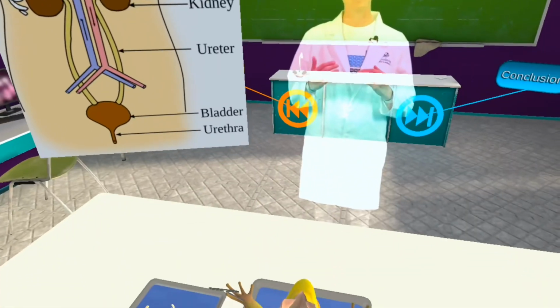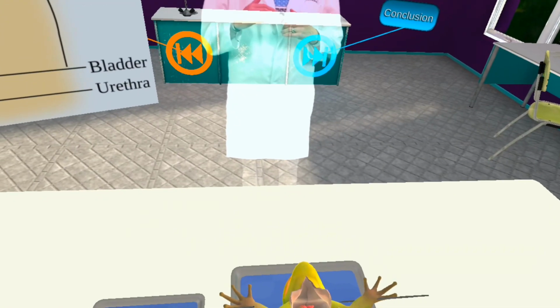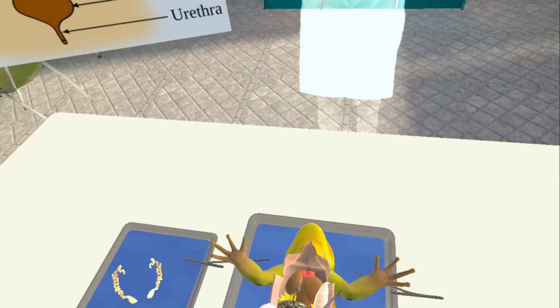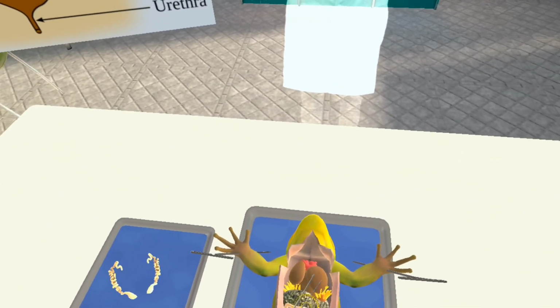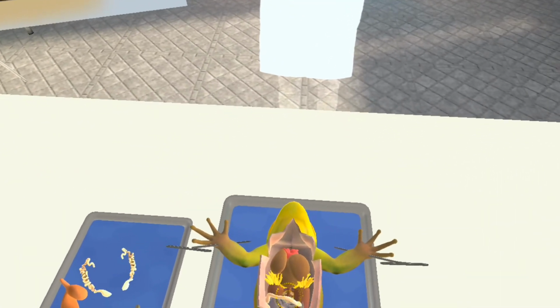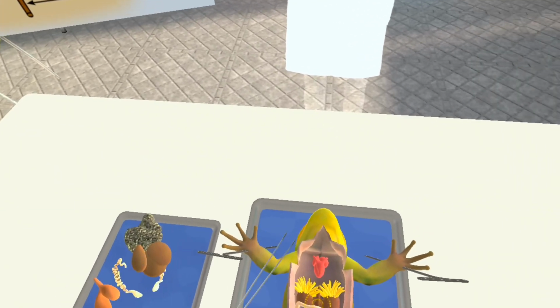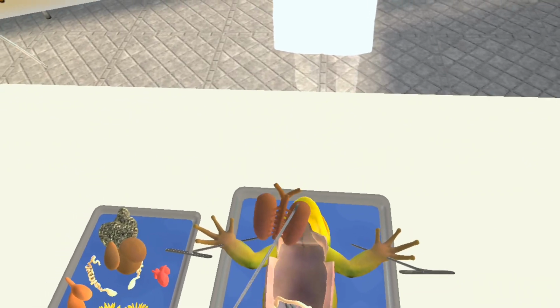Now the kidneys are flat, oval-shaped organs on the back wall of the body cavity, usually beneath the ovaries. Go ahead and find them. Why has all this stuff gone back in? I'm really confused. We've got to get all this other stuff. All this stuff went back in. There's the lungs. Just going to have to get all this out of the way, Wendy. I don't know what happened. Everything just jumped back into the frog. And now, there we go.